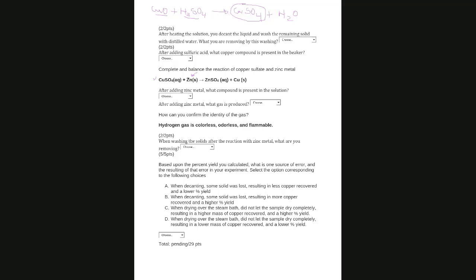And then they will ask you, after adding zinc metal, what is the gas product? We said that it reacts with the acid and forms what? Exactly. Thank you. Yes, that is correct. Hydrogen. Very good.